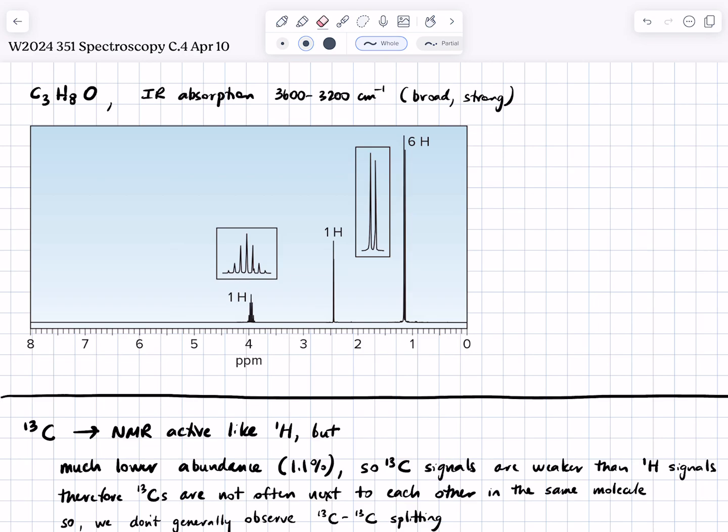But if you had ever done that, you would see that for some cells that you're trying to solve the numbers, you can get the answer from multiple sources. There's multiply reinforcing information. And for other spots, there will be only one way to get the desired information. Same thing can be true for an NMR unknown problem. You will often have multiple sources of information that reinforce that the correct structure is indeed correct. So let's go through that.